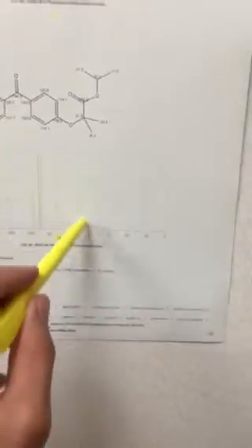As I drop down here, this is our C13 NMR spectrum. This is dealing more with carbon signals instead of hydrogen signals. So we notice we have a lot more peaks here, a lot more signals given off at different locations. Once again, these ppm, these parts per million, are designating where those carbons are that are being broken off. So if we look at this ketone right up in between the 2 aromatic rings, it's giving off a signal of 194.3.